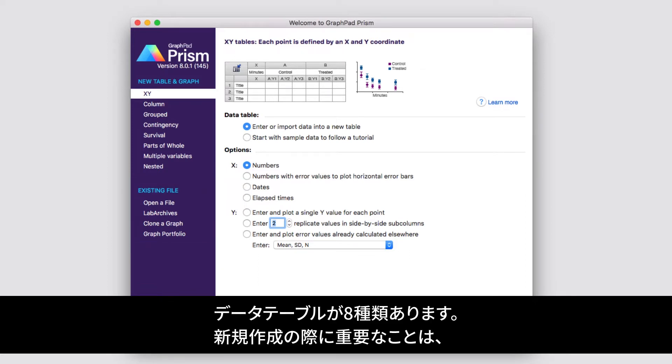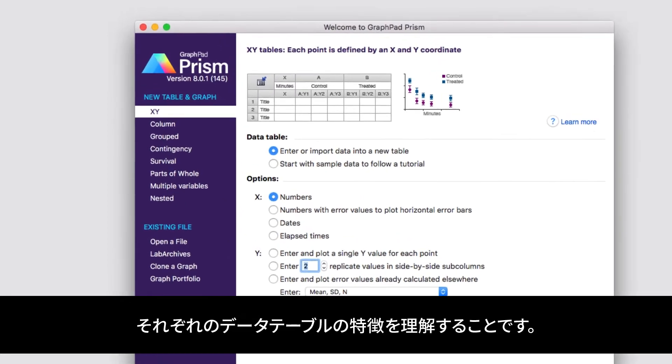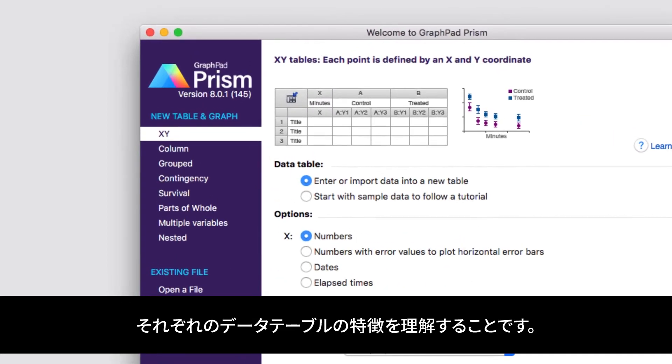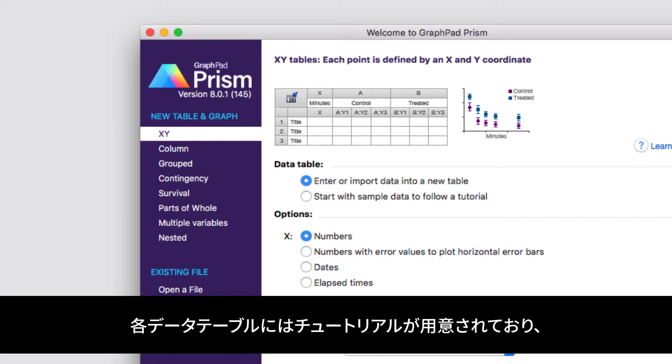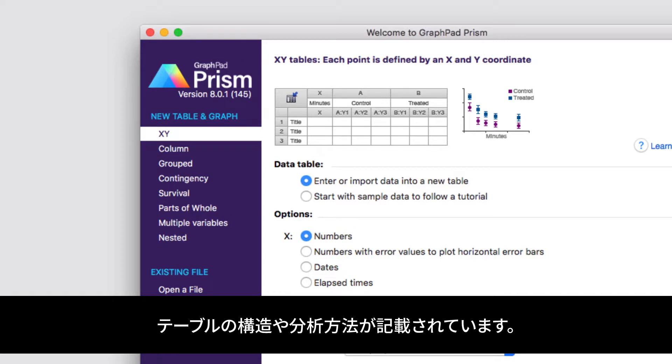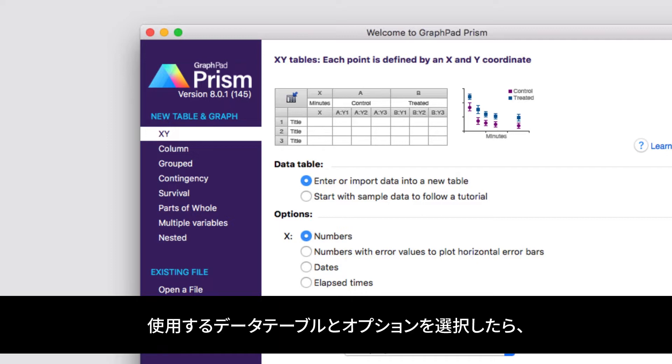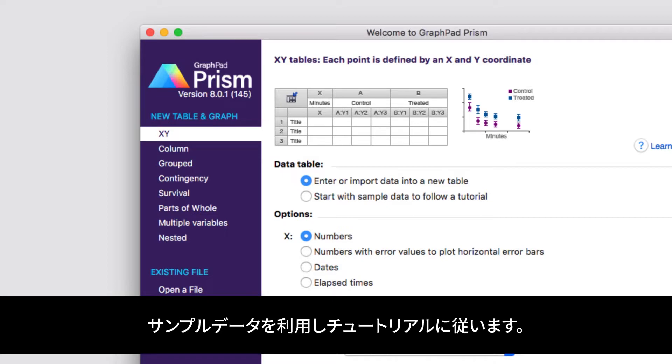Two easy ways that you can do that is to check out our video on the eight types of data tables, or you can use a tutorial data set. Each of the data tables in Prism comes preloaded with a set of tutorial data that you can use to understand how the tables are structured and how to perform different analyses within those tables. To access the tutorial data sets for any of the data tables, simply select the data table that you'd like to work with and then choose the option Start with Sample Data to Follow a Tutorial.